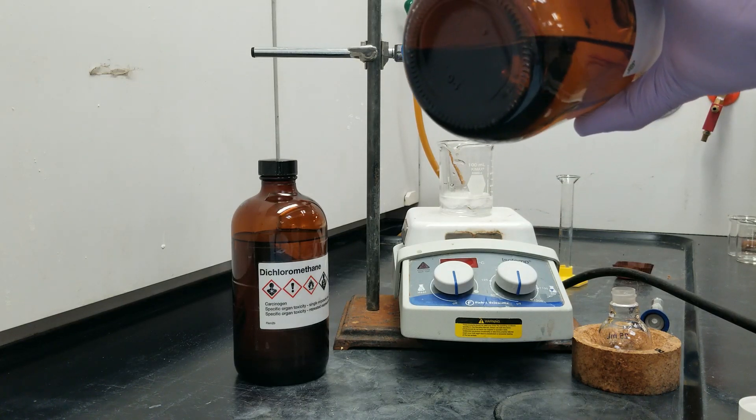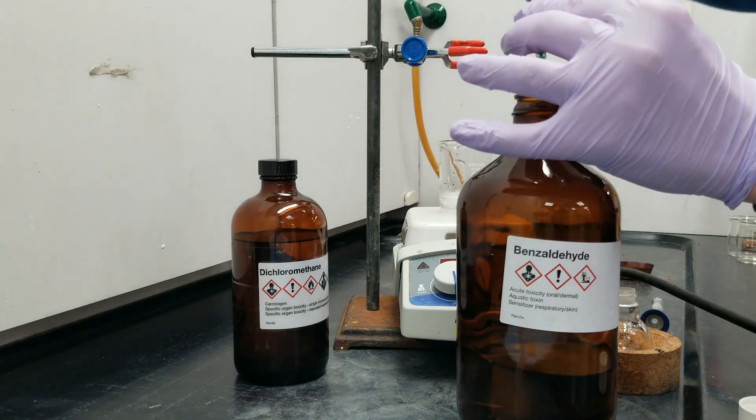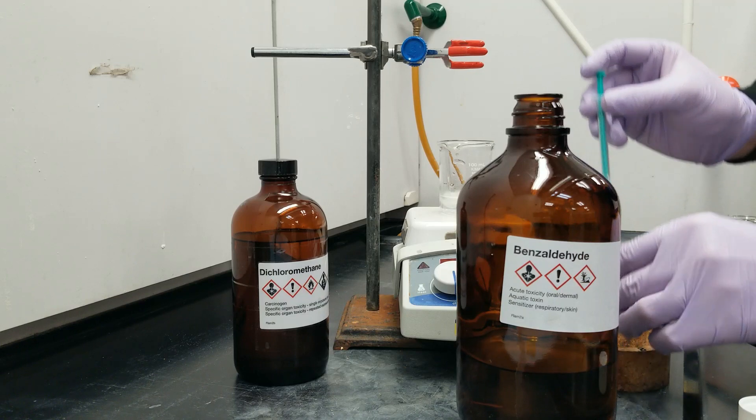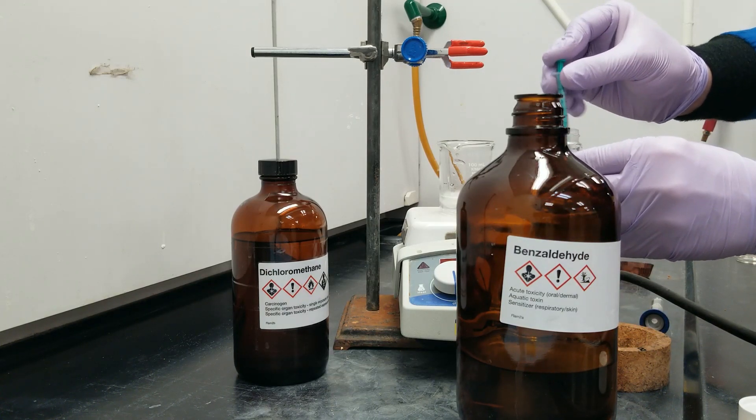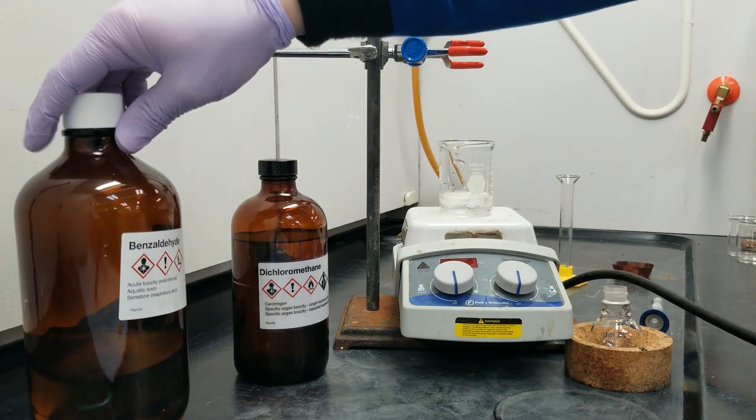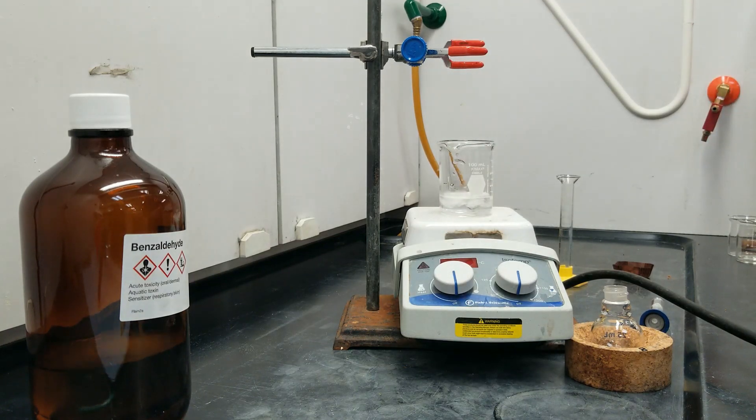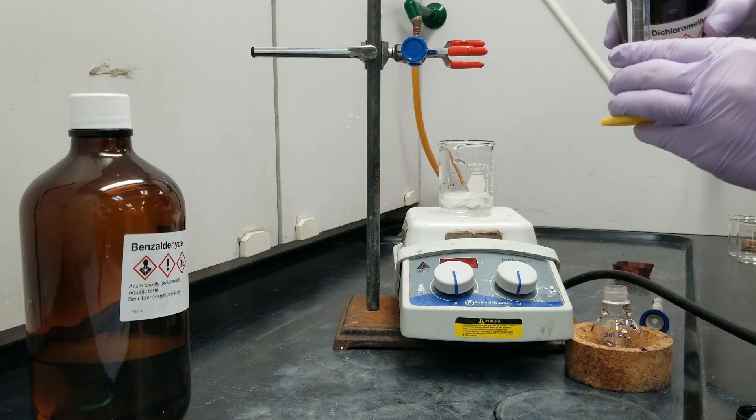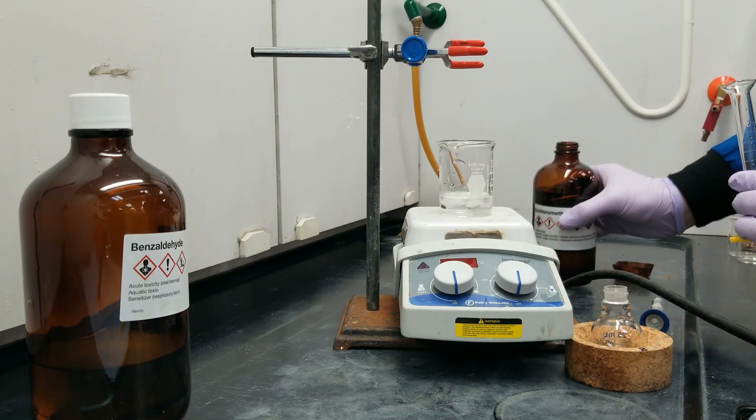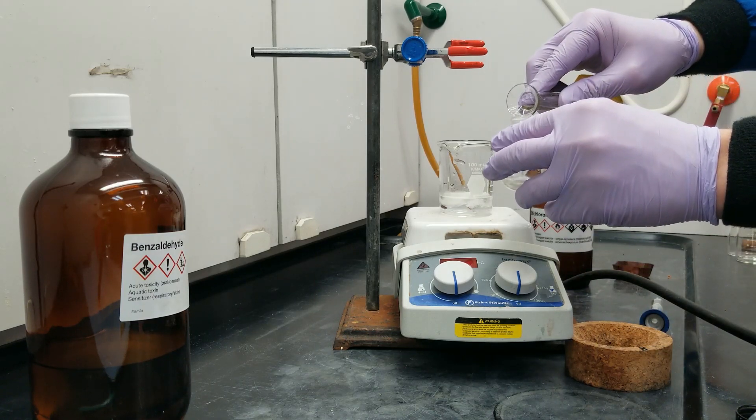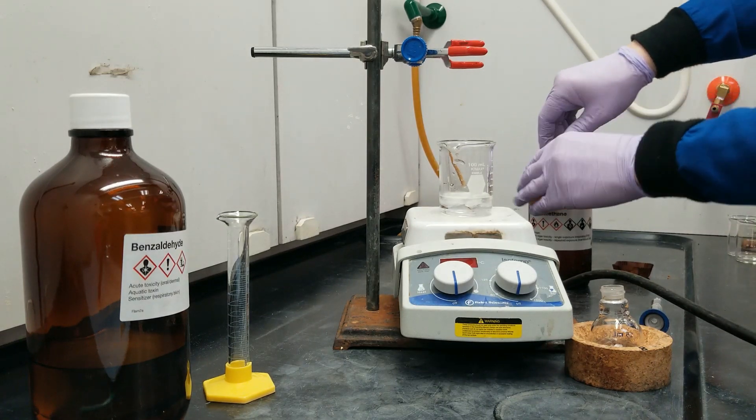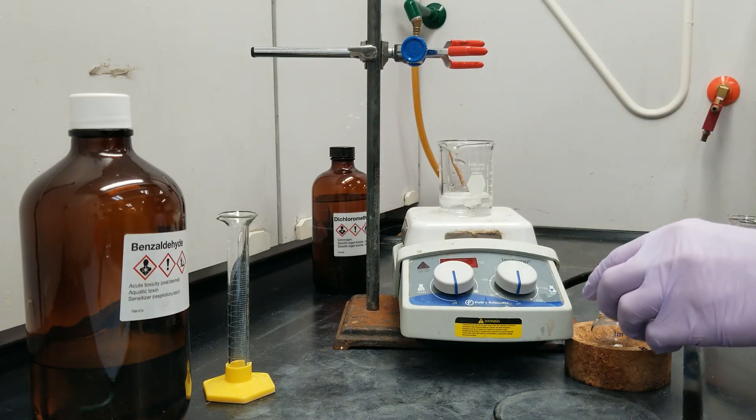Benzaldehyde, being an aldehyde, has a slightly positively charged carbon. And I'm going to use 5 milliliters of dichloromethane as the solvent in today's reaction. We're just going to homogenize this and get the benzaldehyde evenly mixed into the DCM by stirring.